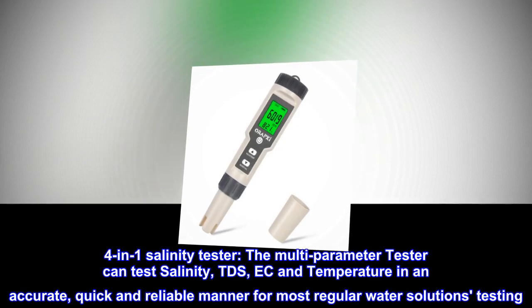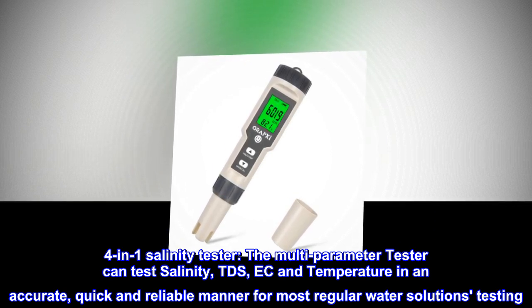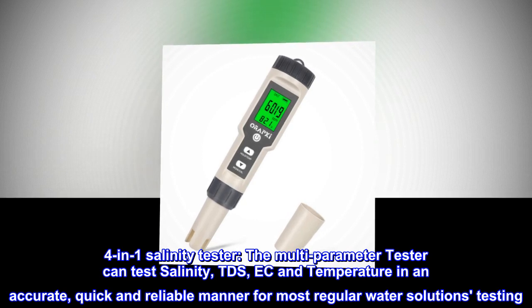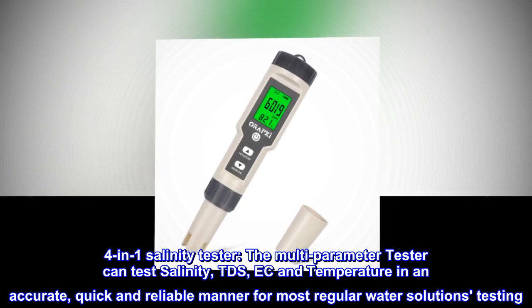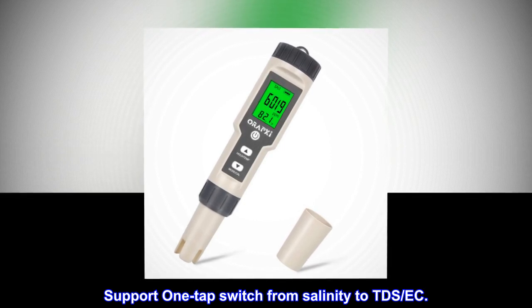4-in-1 salinity tester. The multi-parameter tester can test salinity, TDS, EC, and temperature in an accurate, quick, and reliable manner for most regular water solutions testing. It supports one-tap switching from salinity to TDS and EC.